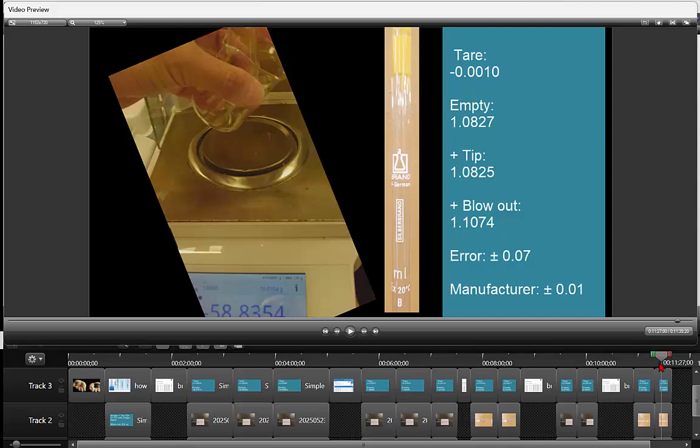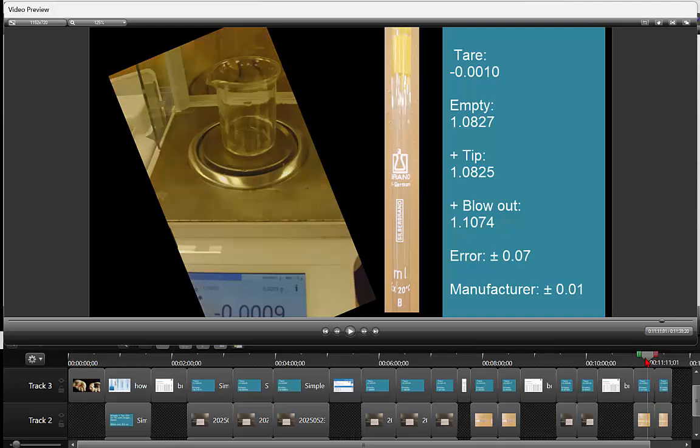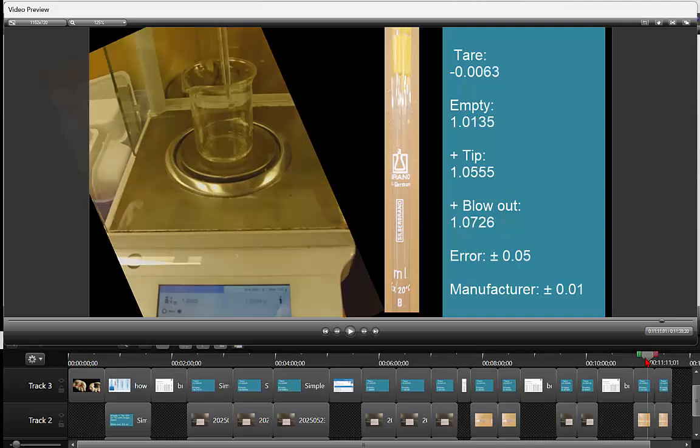The only way to actually know is to do what I did here, is to grab your pipette and test it out a few times, and then make sure you keep that pipette as your friend and you know that pipette well and how that pipette works, because there really is no guarantee whether or not they write EX, TD, IN, TC and they have a single or a double band. You're never going to know. You have to test it out. Okay? That's the horrible reality.